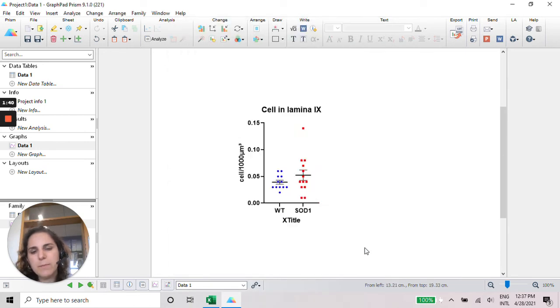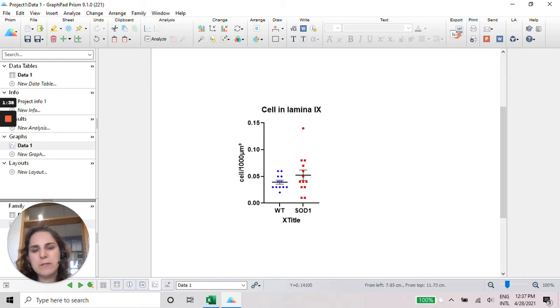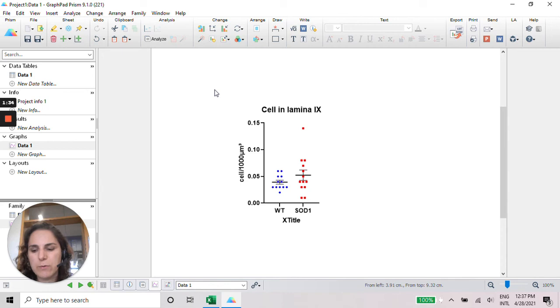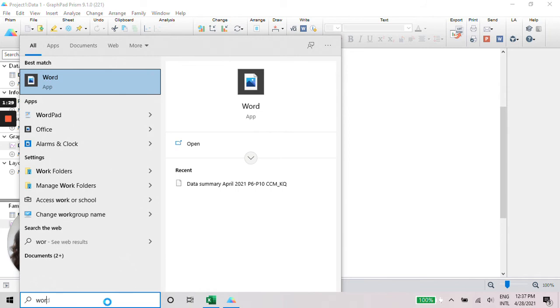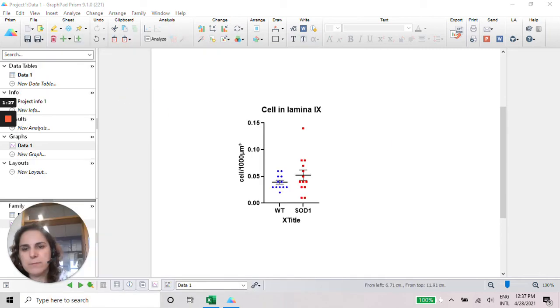And that's it. Once this is done, you can select everything or just do a CTRL-C, CTRL-N, CTRL-V somewhere else. And you're going to have your graphic ready to be used.